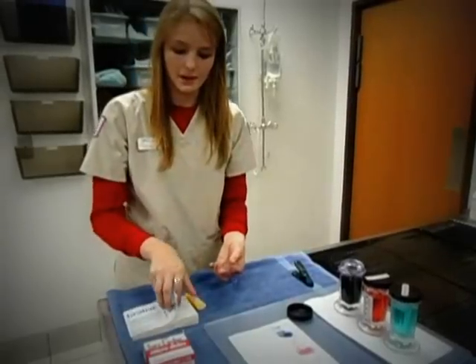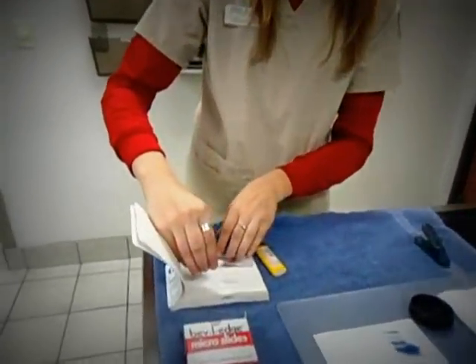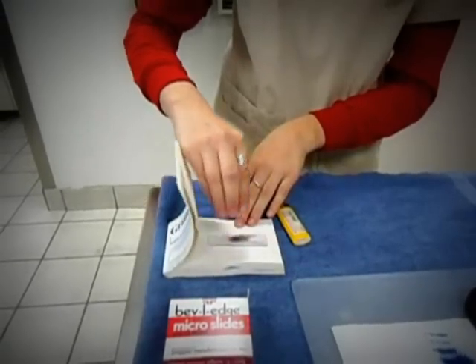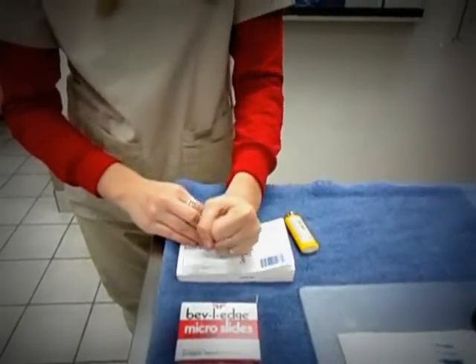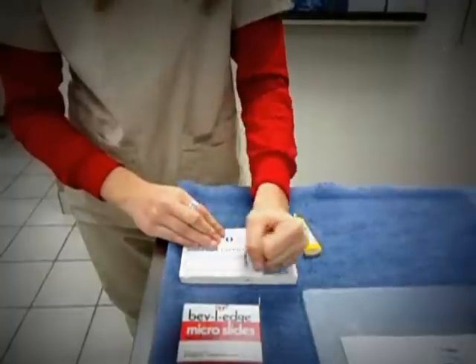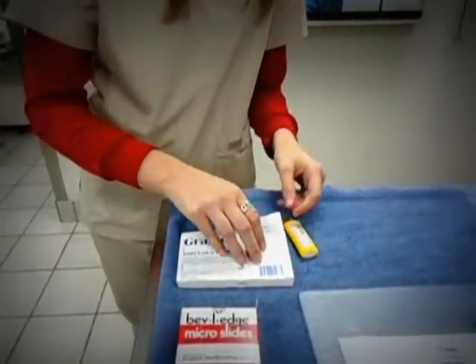Now I take it over to my bibulous paper and find a blank page. I place the left side closest to the inside and stroke along the pages. This removes any excess moisture from the slide so that the doctor can look at it under the microscope at high powers.